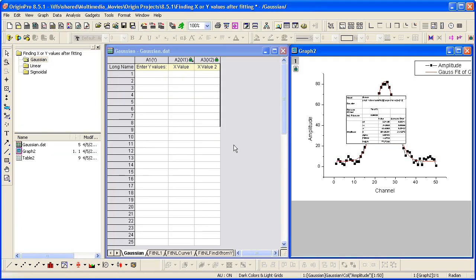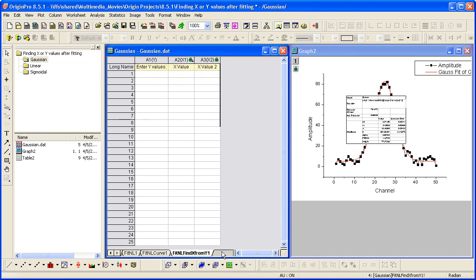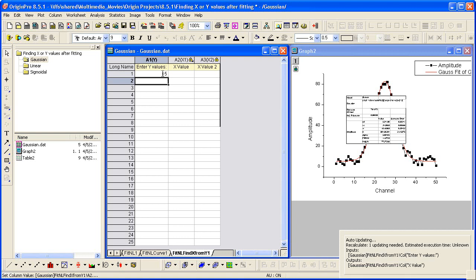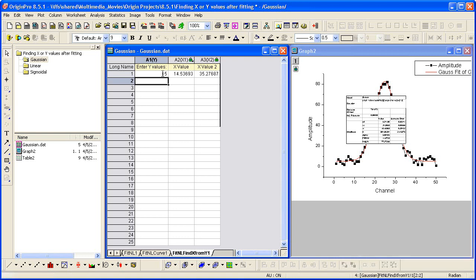I get my results. And the last sheet in the book allows me to enter in a particular value here for Y. Let's enter a value of 15 and then both X values are calculated and output for me.